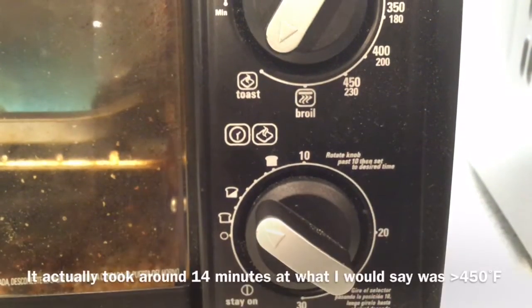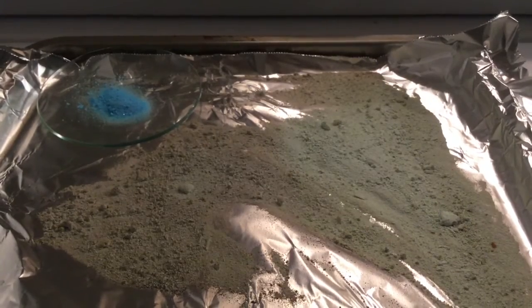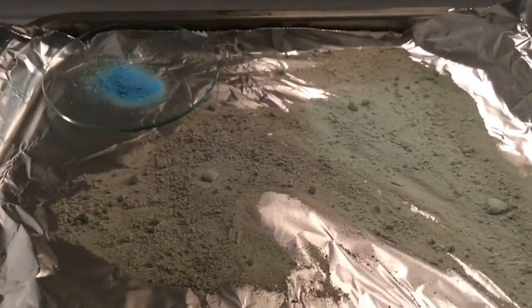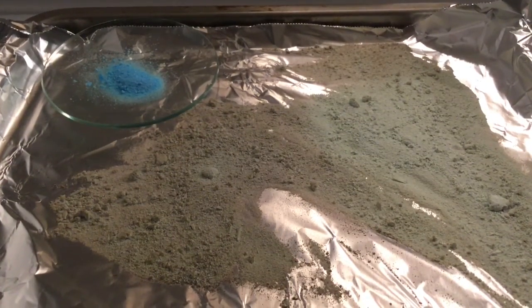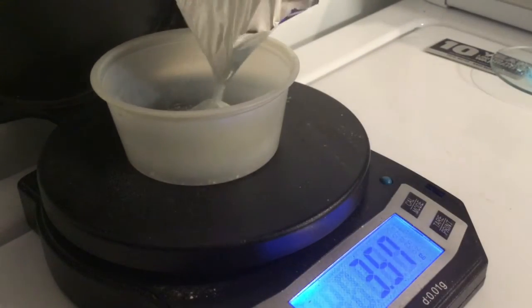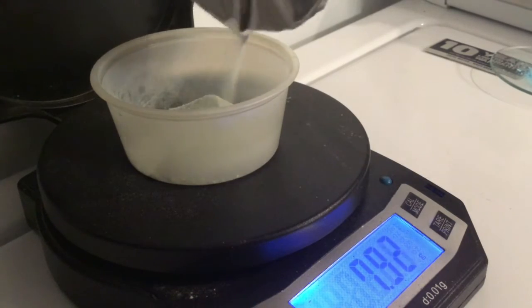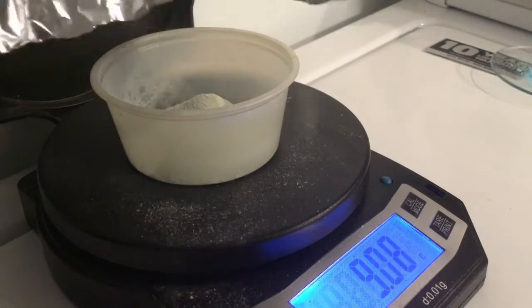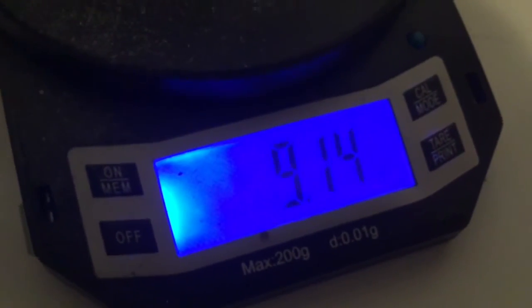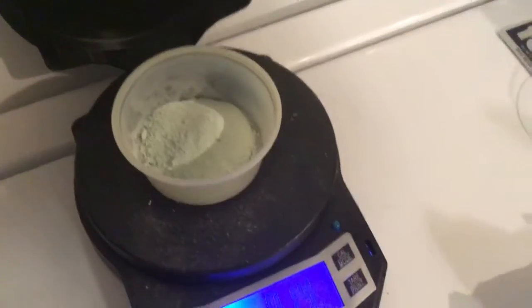Here's our anhydrous copper sulfate. I might have over-dehydrated it a little bit, but here it is compared to the pentahydrate form. Let's mass the anhydrous copper sulfate — our final mass is 9.14 grams.